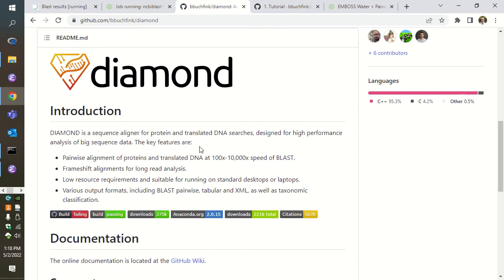So I'm going to use Diamond. Diamond is not Blast. They are not identical. However, Diamond is very, very powerful at accelerating searches that can produce scores very much like those of Blast. I believe that the statistical models used for producing e-values are the same in both of them. However, the way in which the search is accelerated is slightly different.